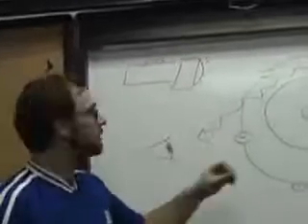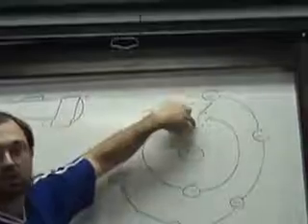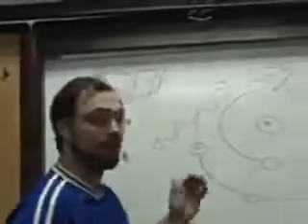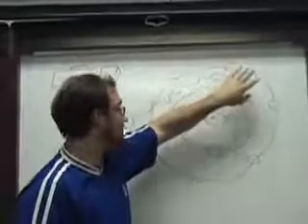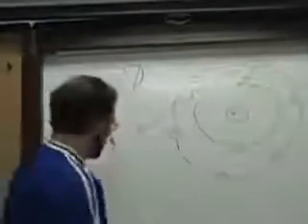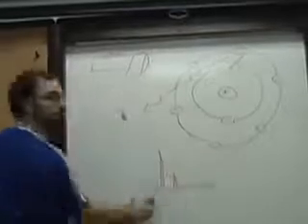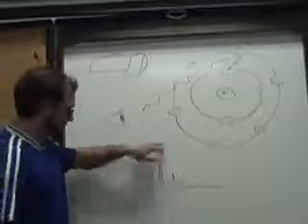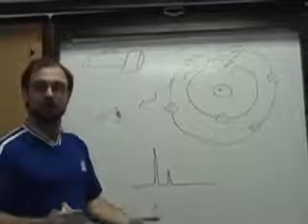which looks at it, and our detector can tell the energy of this. The way this all works is the energy transition here is characteristic for a given element. So you can imagine for iron, this transition has one energy, so we measure one peak for iron. These come in pairs because electrons travel in pairs based upon spin.